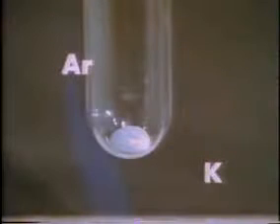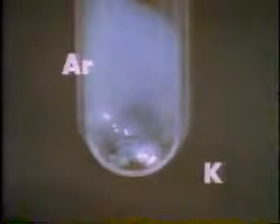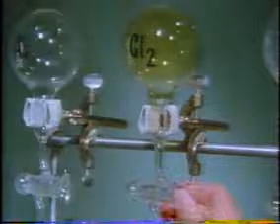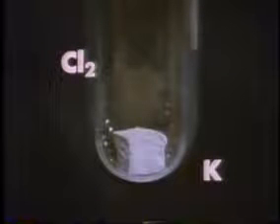The potassium melts. The oxide coat cracks, exposing shiny potassium, which slowly vaporizes, carrying the oxide dust with it. The quiet, shiny surface indicates that no reaction occurs between the gaseous argon and potassium. Next, chlorine and potassium. There is no apparent reaction, perhaps again due to the coat of oxide. When heating exposes fresh metal, reaction does begin. Solid potassium chloride forms.